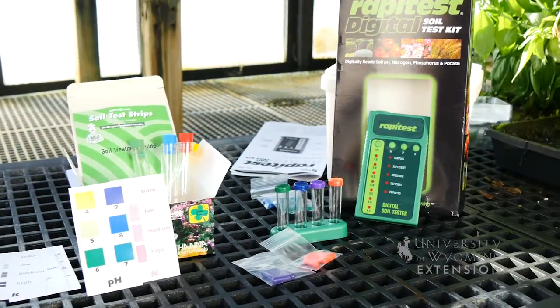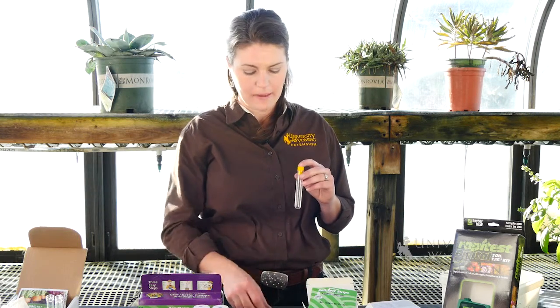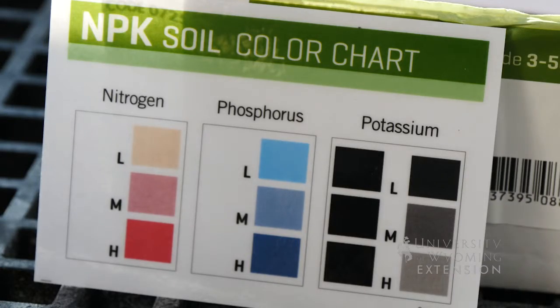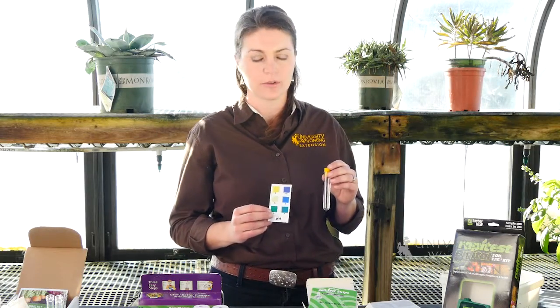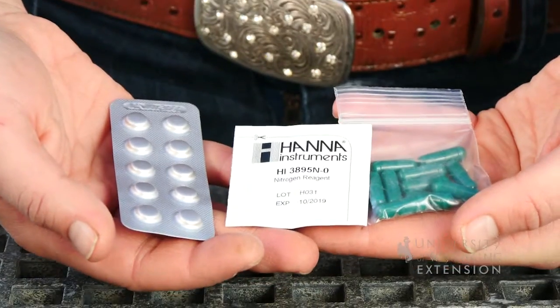They are all based on adding soil, water, and a reagent to a tube and then matching the color in the tube to the color on a card. So they're a simple test and will give us some general information about the status of our soil. Once you've added the soil, reagent, and water and followed the instructions, you will match the color to one of the color cards.